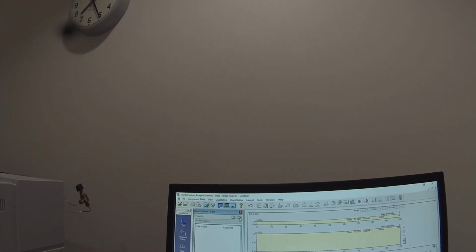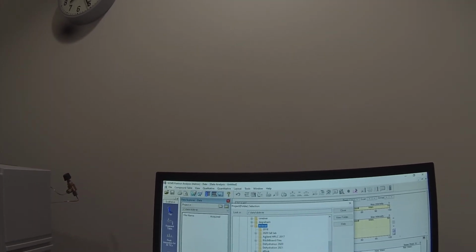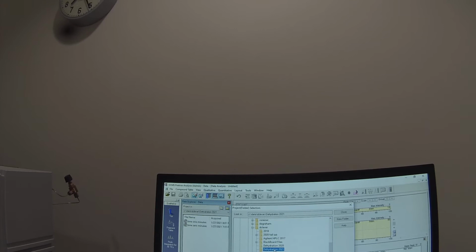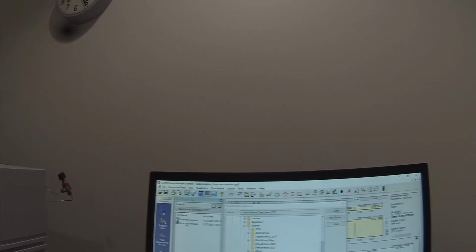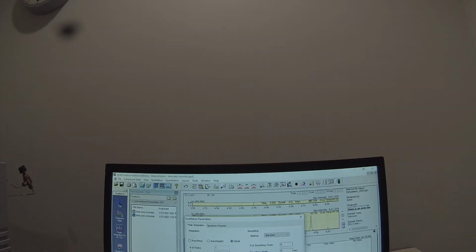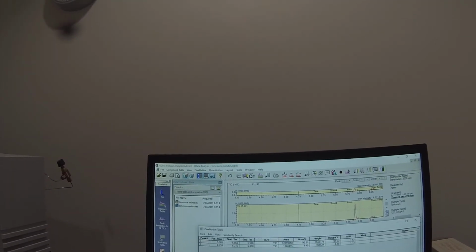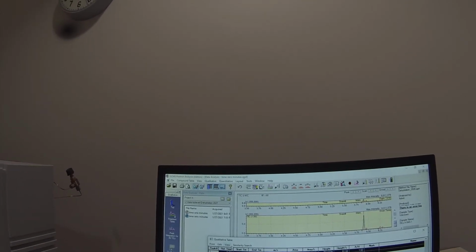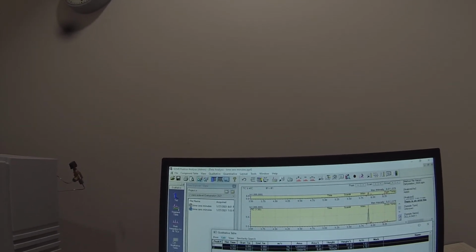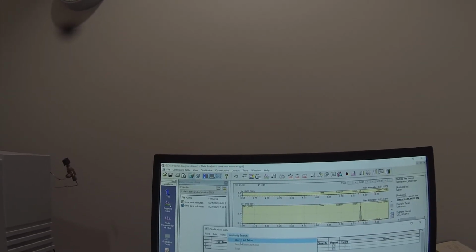Have to go back and select project again. Though it didn't save any of that, we'll integrate again. Go back to our qualitative table and tick. And have to re-register those to the spectrum process table and go back to our similarity search.